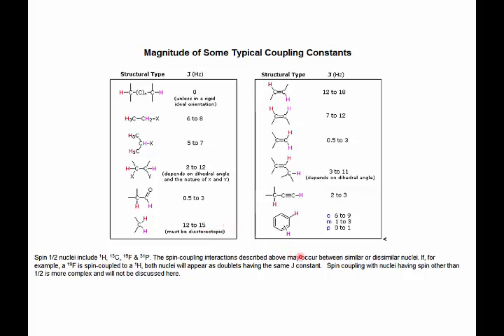Now there is something else that deserves comment. Research has shown that the communication between two coupling protons is not a through space phenomenon, but rather it's an effect that operates through the chain of bonding electrons that connects the protons.